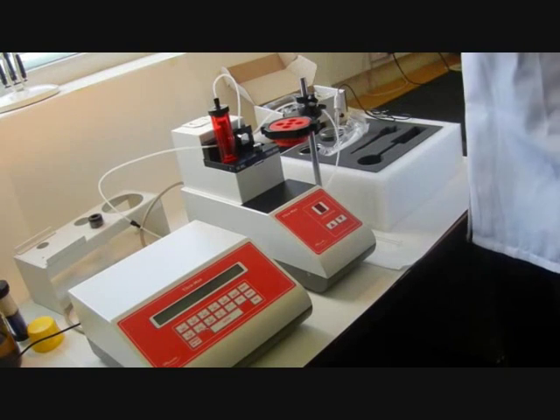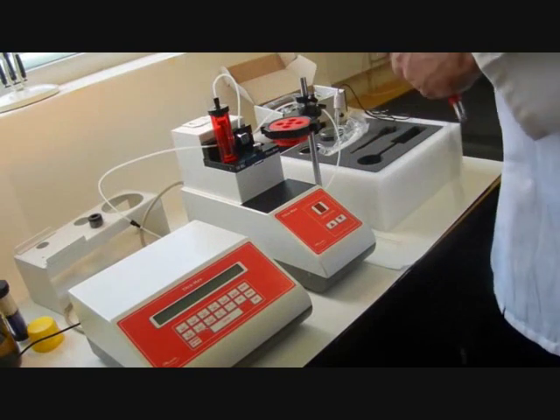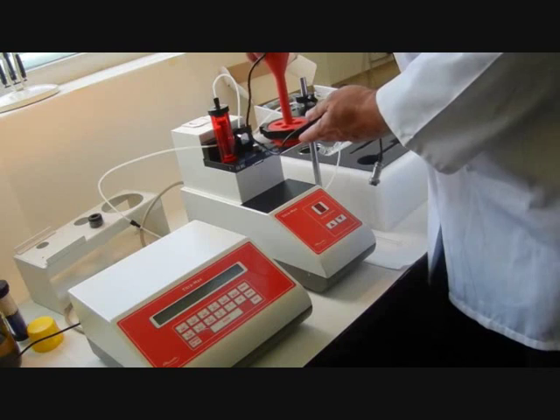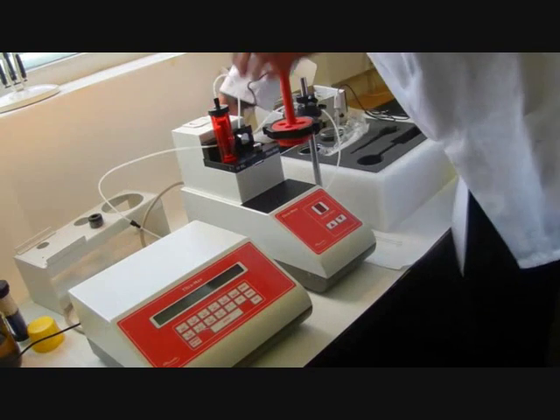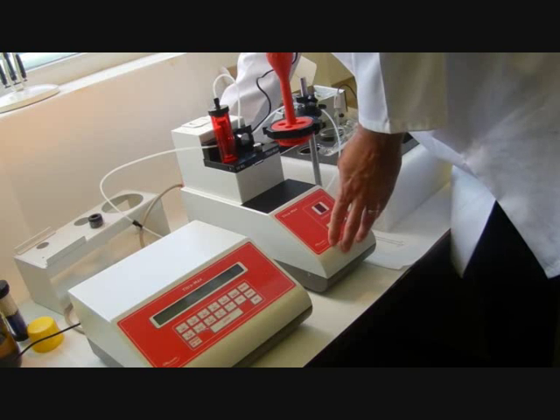Next we can take the stirrer motor and screw that into the top of the titrator head. This plugs in to the base of the titration unit.